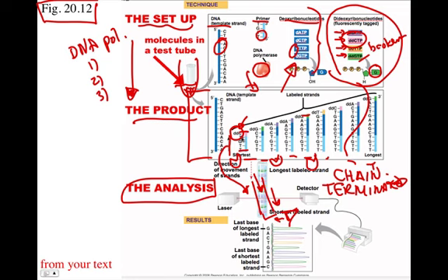And the first color that comes out is pink, and then green, and then purple, purple, green, yellow, pink, like that. And they know the original dideoxynucleotide colors, and they can interpret the colors to be the corresponding nucleotide letter. And so that's how the actual reading gets done: the spectrophotometer eye watches the color, and the color is associated with one of the original nucleotides, and so we can read the chain.